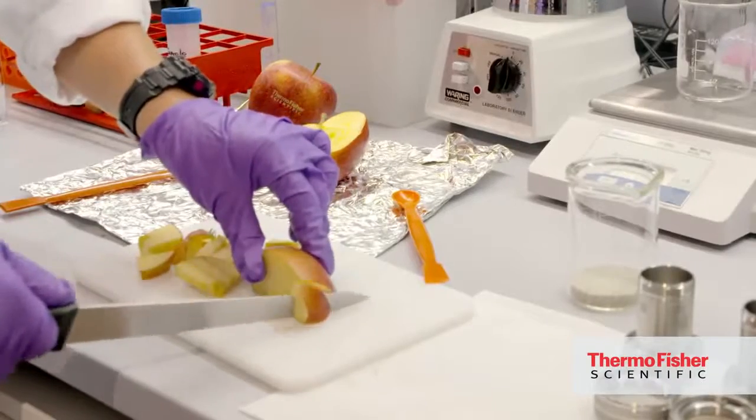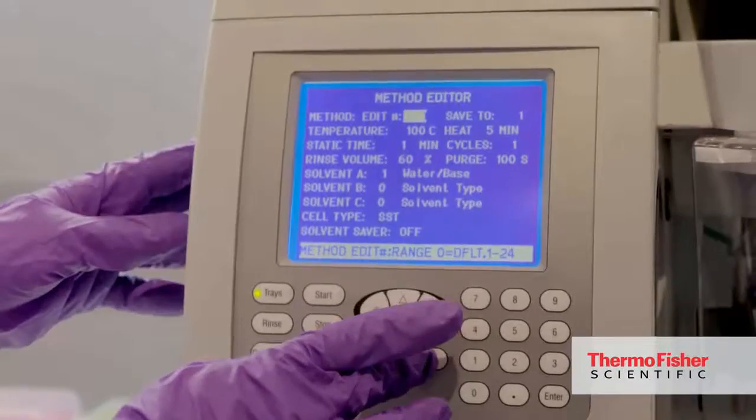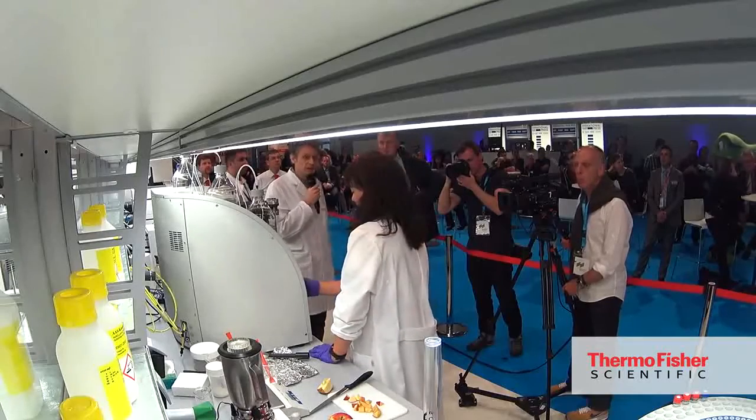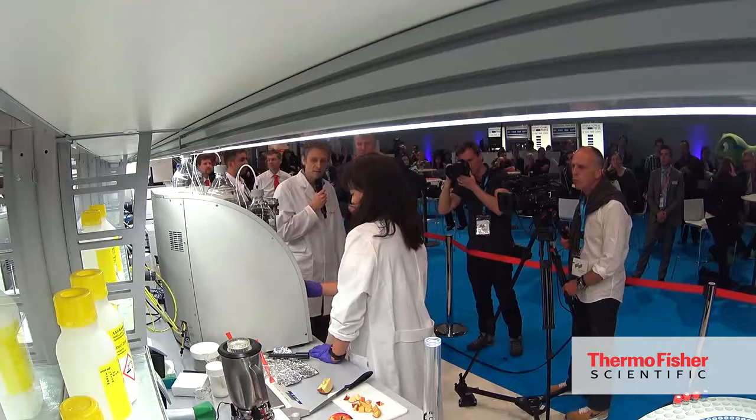What we've done here during the live lab is a full sample preparation. We just took some apples and demonstrated for the audience a method procedure - how we clean up a sample and what is really the workflow for pesticide analysis.